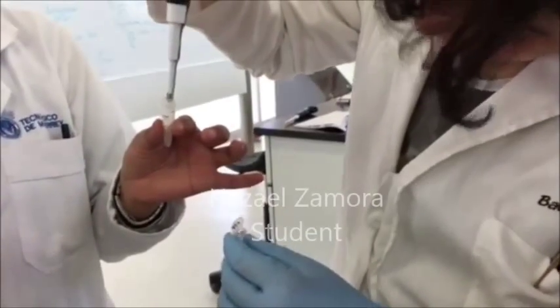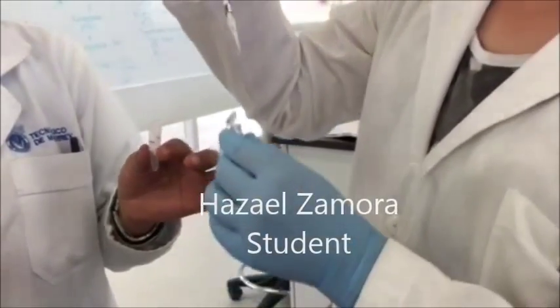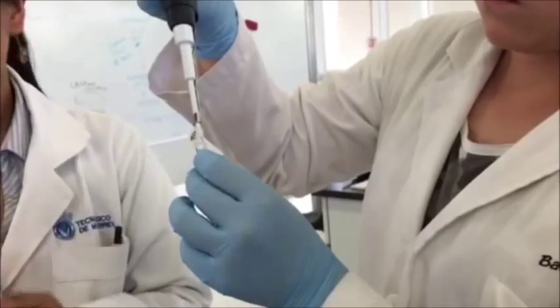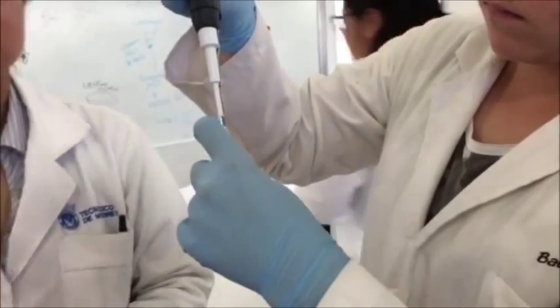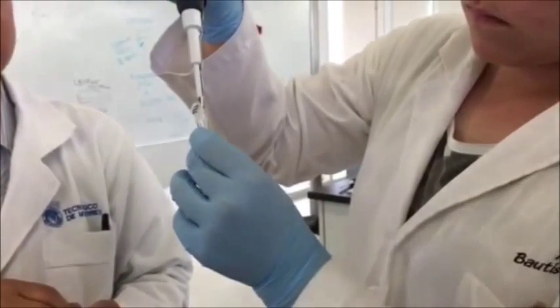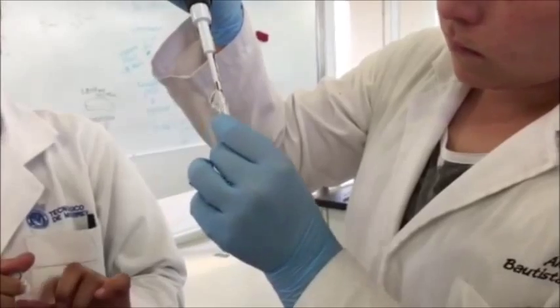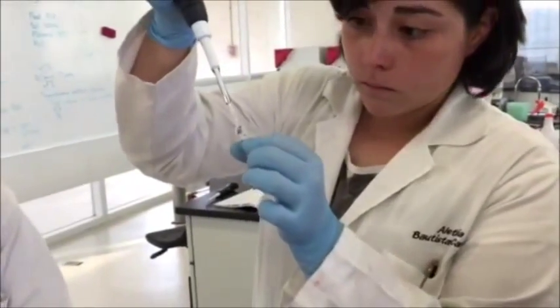This protocol consists of 8 steps. The first step is to thaw the PCR product. Then you thaw the reagents of the kit of the PCR 2.1 topo plasmid and keep them on ice. Then you do the ligation reaction for the chemical transformation or electroporation transformation. Then you incubate it at ambient temperature for 10 minutes.